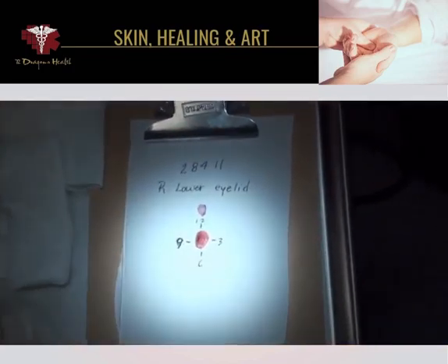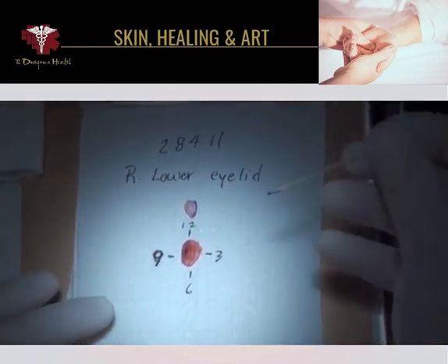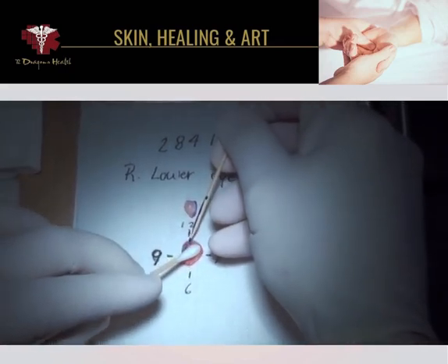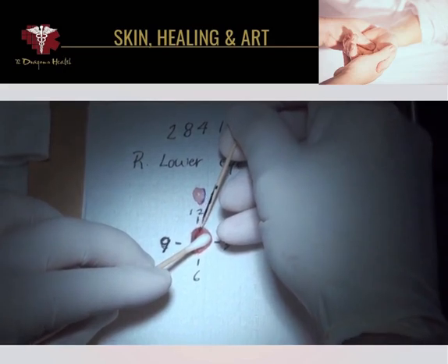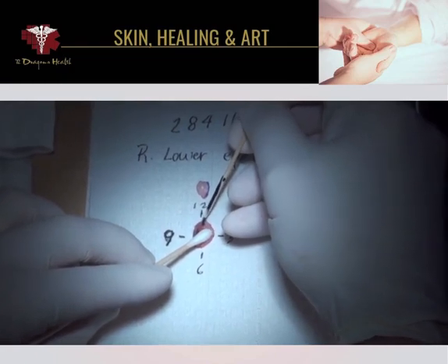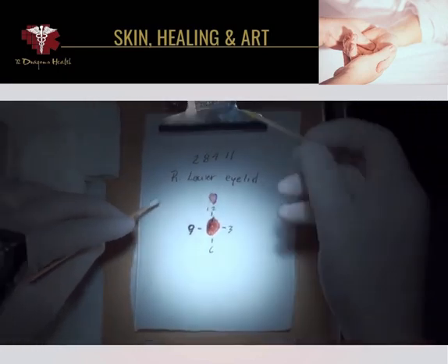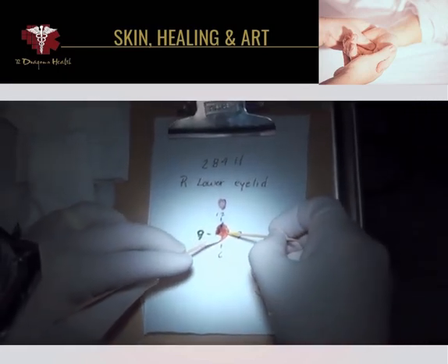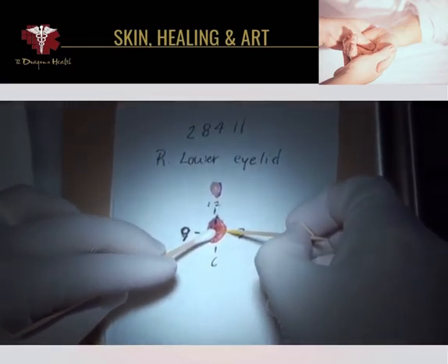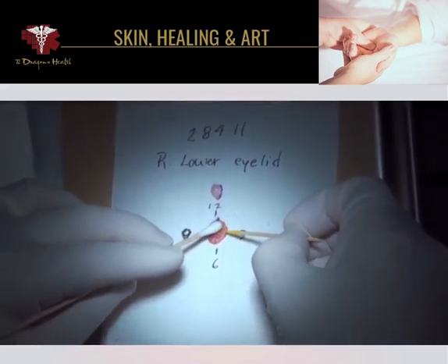We simply mark the specimen in a way that orients our tissue. We put blue dye at 12 o'clock right in the nick, and yellow dye at 3 o'clock. This allows us to orient the specimen so that when the tissue is actually cut, the dye will be seen when we look at the specimen under the microscope.